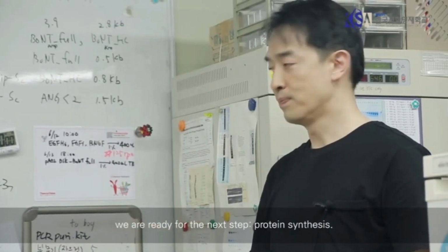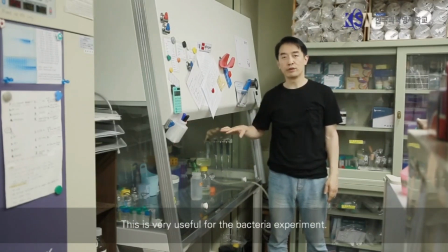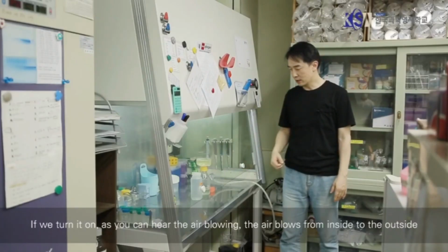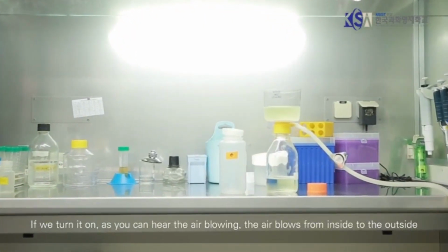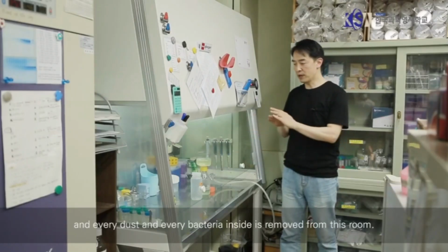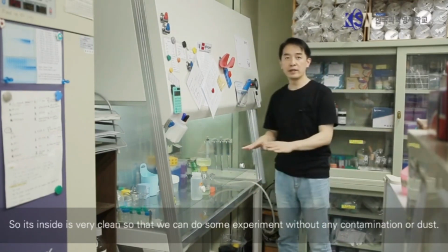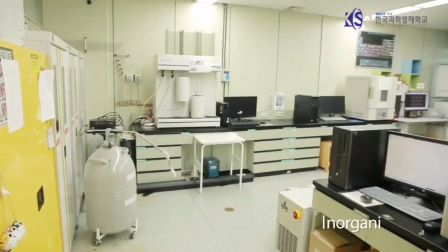This machine is called a clean bench, and this is very useful for bacterial experiments. If we turn it on, as you can see, you can hear the sound of air blowing. So the air blows out from the inside to outside, and every dust and every bacteria inside is removed and expelled outside. So the inside is very clean, and we can do experiments without any contamination, without any dust.